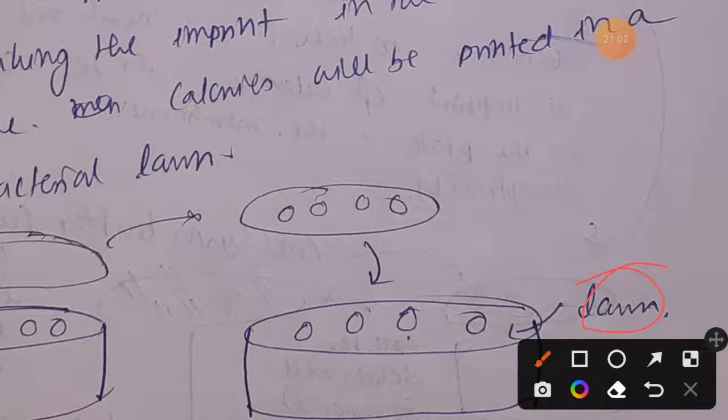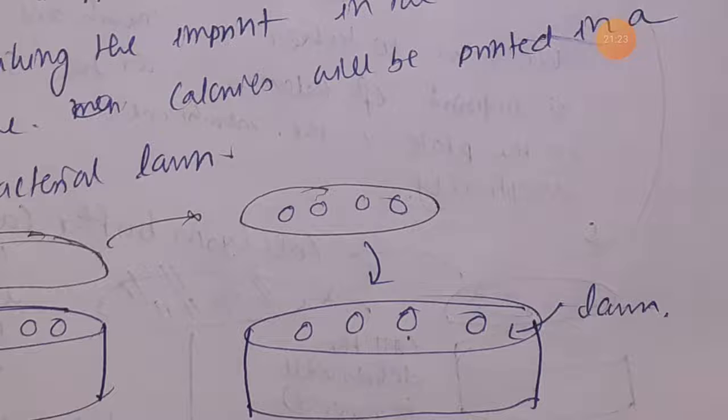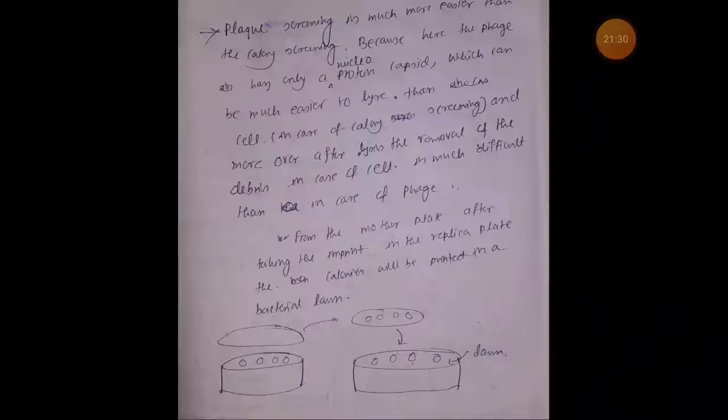Nothing but the bacteria itself. So we have to provide bacteria as a food material. In colony hybridization we provided an appropriate agar medium during replica plating, because there we are growing bacteria. Similarly, for growing phage, we have to provide a bacterial lawn so that they can grow and develop plaques. So that was the idea regarding colony hybridization and plaque hybridization.